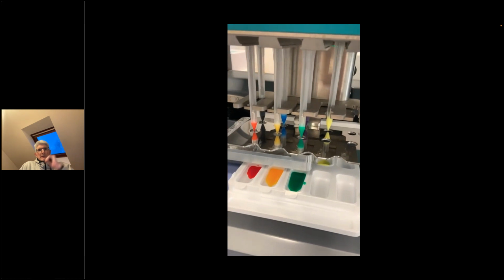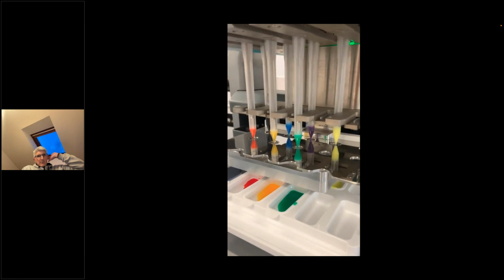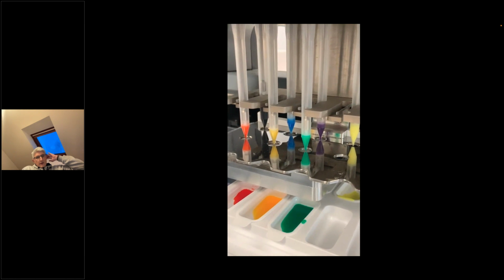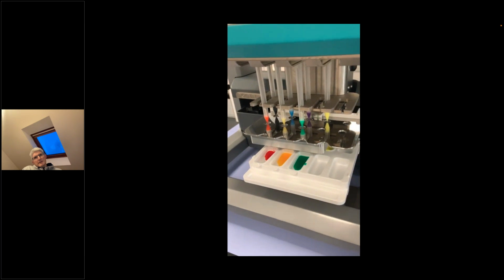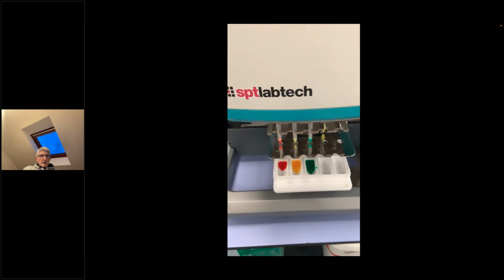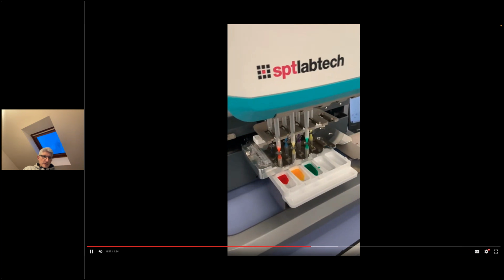And so it can do a complex array of different additions into the plate with rapidity and ease. So in this case, it's just using some dyes to make a pretty picture because it's a way of demonstrating how the robot works and how it can look. But this then applies equally, or maybe even more so, to highly complex design of experiments designs.